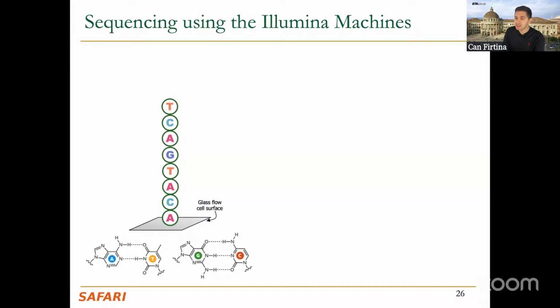So knowing this connection information, what we can do is, as this DNA stands like this, for example, on the glass surface, we can release agents, perhaps only a single T base, or maybe even multiple, that are floating around the region, right?